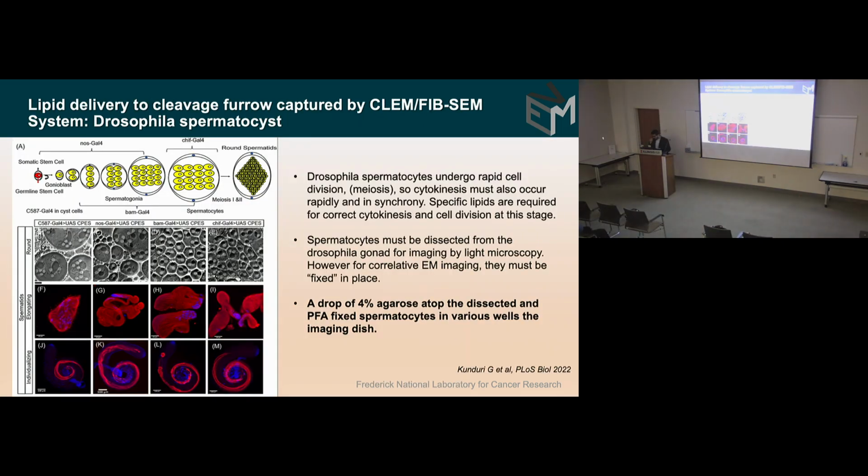And so in one of our collaborations recently, a collaborator wanted to look at cell division in the male Drosophila spermatocyte, right?